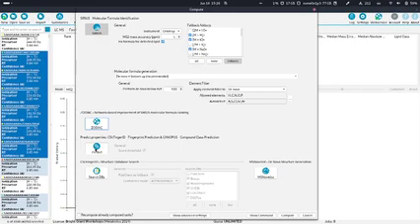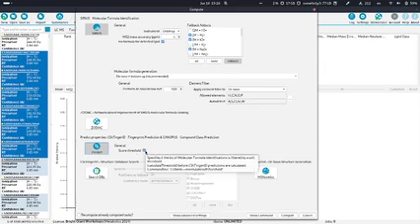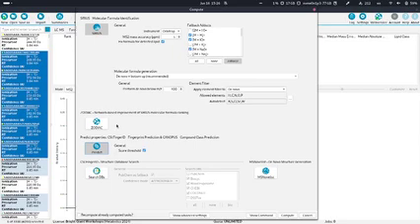The next thing, which I also mentioned very briefly, is that we can now predict fingerprints and properties in general. So I said already that now CANOPUS is included in this box here. If we turn it on, there are not many settings you can select in this basic mode. What is toggled on by default is that, because here we can get really many molecular formula candidates from SIRIUS, we only use the top scoring molecular formulas to predict molecular properties.